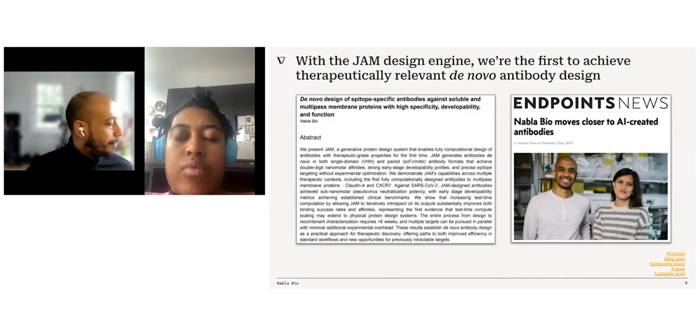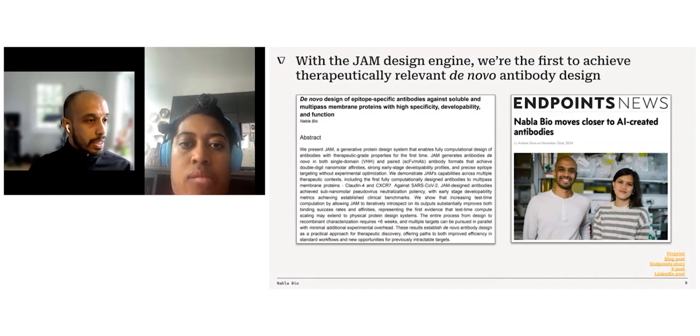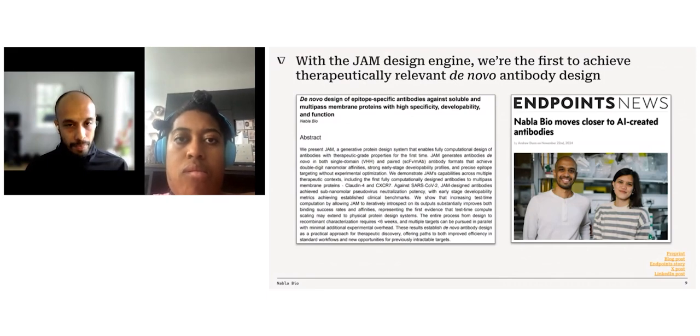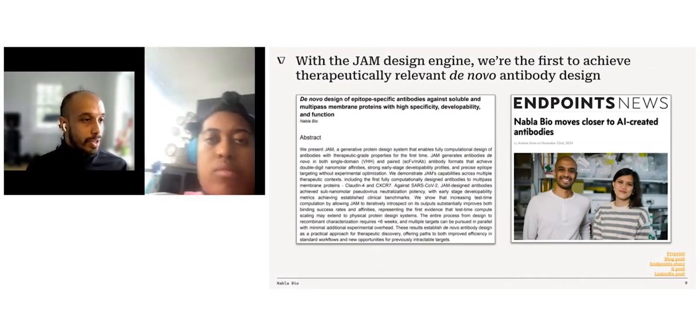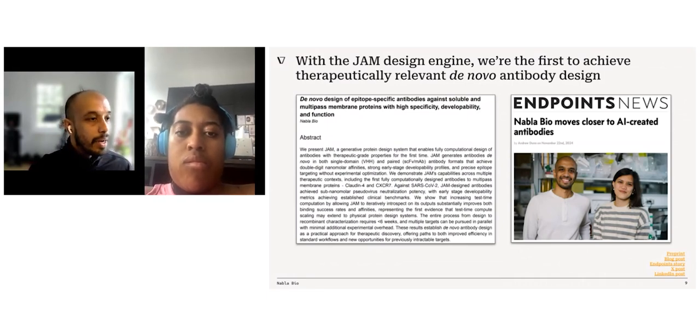Yeah, so the short answer is yes. For the designs that were successful there and selective, it was a combination of designing the CDR3, but there are several residues in the framework that are important for driving that interaction.